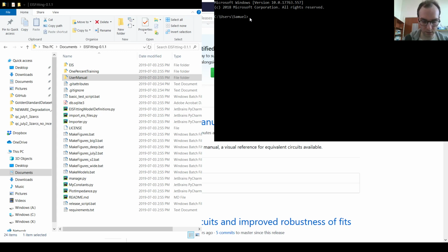It's important to know that we need Python 3 for this. So if the default version of Python on your system is not Python 3, you would need to add as an option Python, for example, 3.6 or Python 3 when you create the virtual environment.